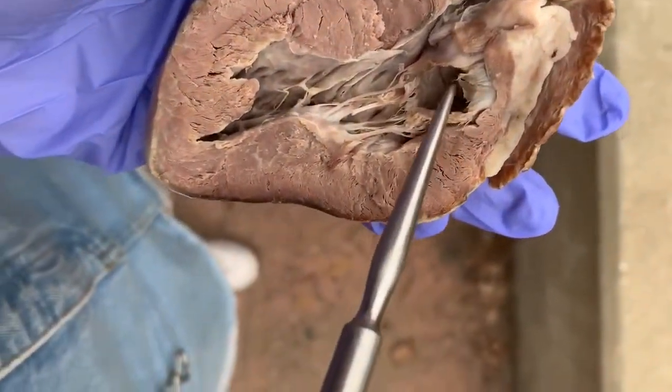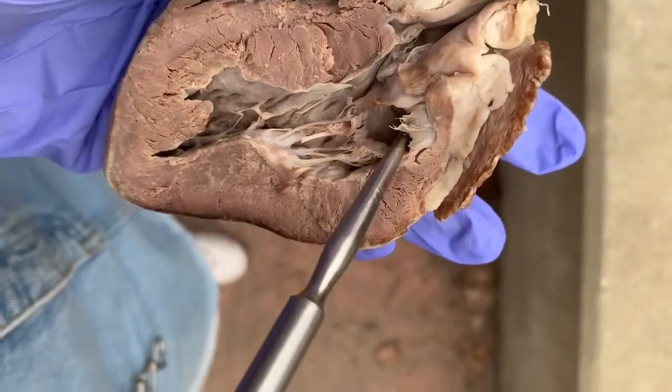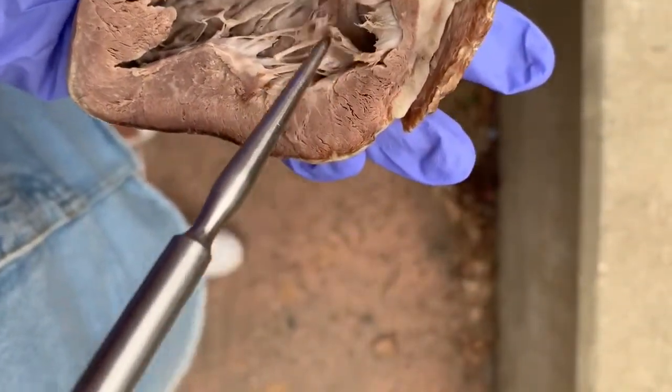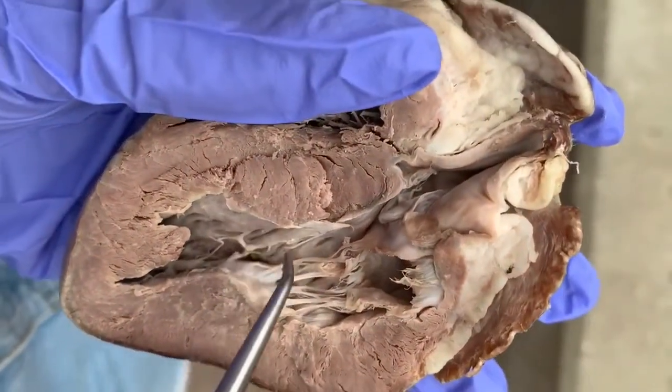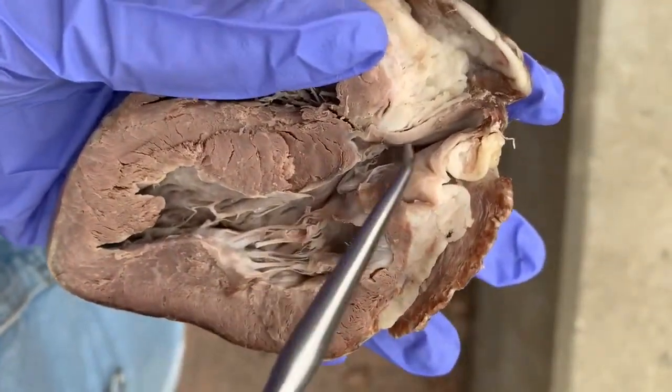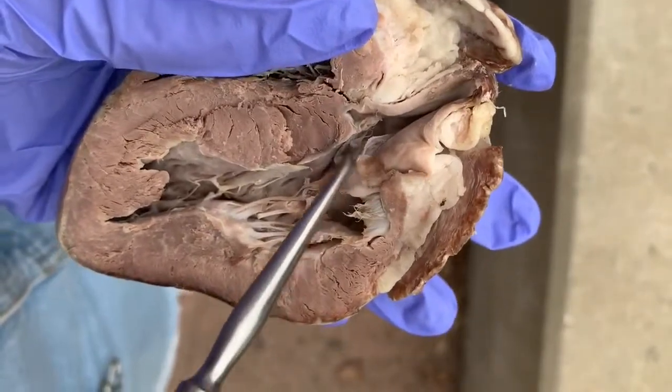And then over here, from the left atrium to the left ventricle, in between is the mitral valve. And then from the left ventricle to the aorta is the aortic valve.